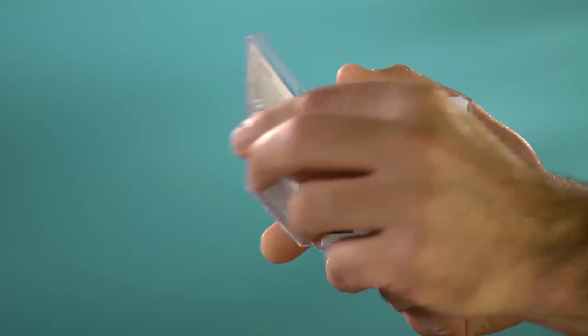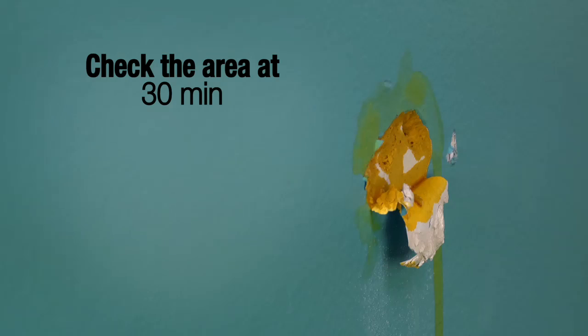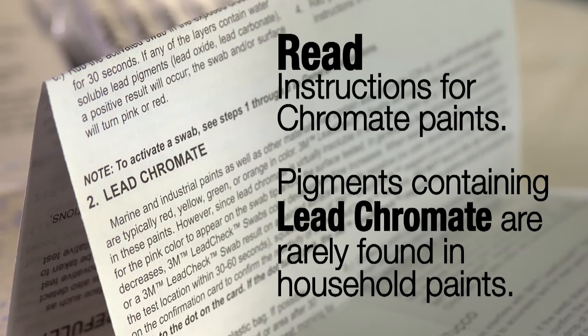Testing some industrial paints requires longer development time. Make sure to check the area at 30 minutes and again at one hour for red color development. Pigments containing lead chromate are rarely found in household paints.